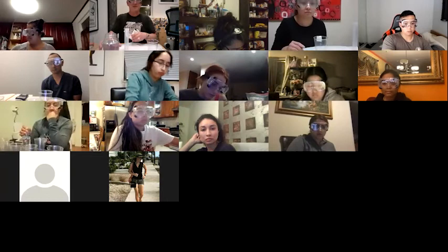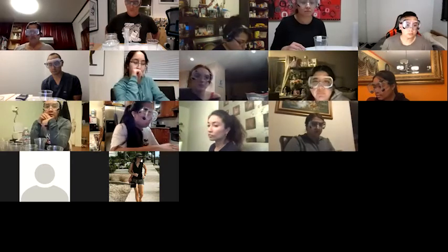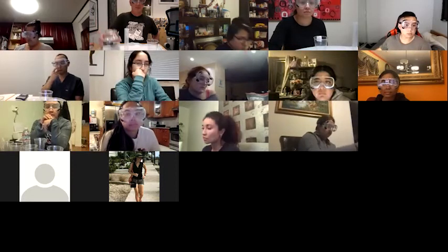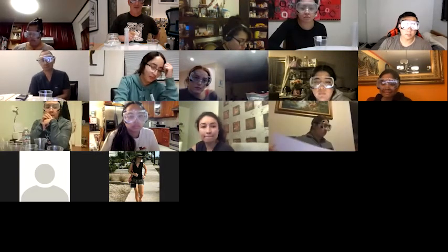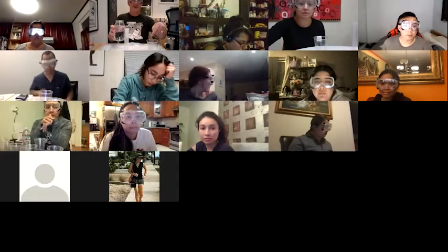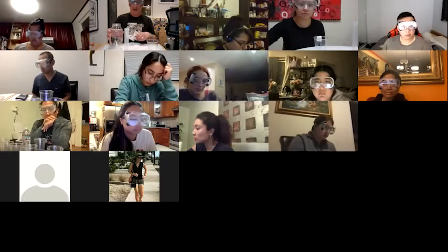So how are we going to measure 50 grams of water? Do I just dump this directly into the cup? Maria says, no, I shouldn't do that. She's absolutely right. You don't want to just dump it right in there, because if you splash it over, it's going to splash onto your electronic component, and that's a bad idea.